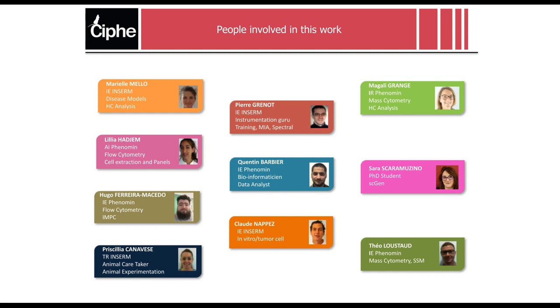So definitely using metadata tags to drive illustration, the way I can plug my metadata describing my sample directly with the FCS file using an Excel spreadsheet, that's super convenient because you can have lots of meta tags that you want to use. In different methods you have to add keywords. I mean, it's quite laborious. Here it's very easy to do.